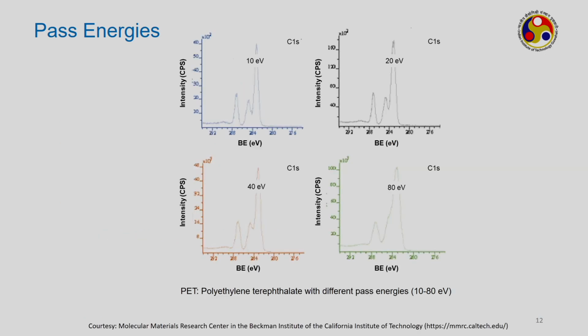So, suppose there is a sample here. This is R1 and this is R2, and let us say this is your R0. When the electrons enter here and exit here, suppose this is a slit here.